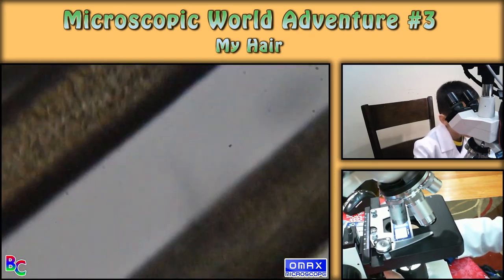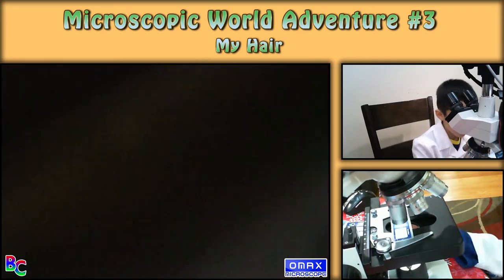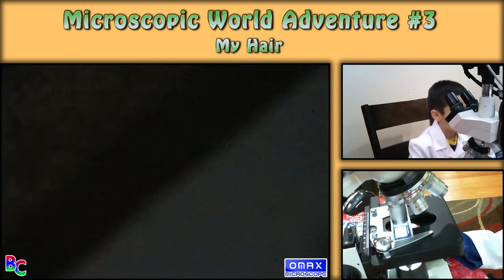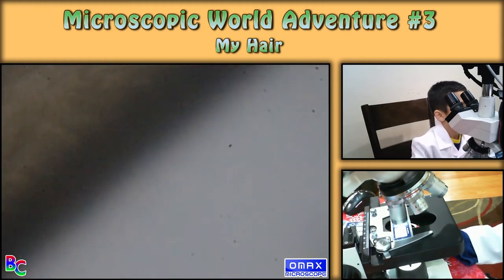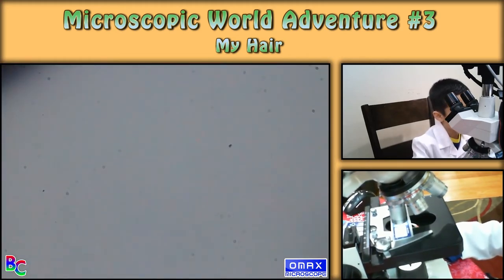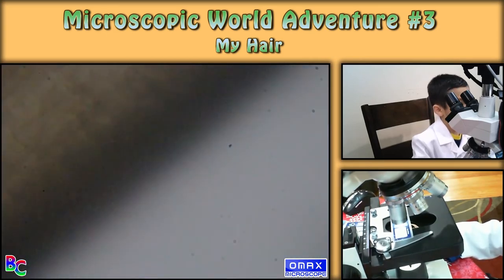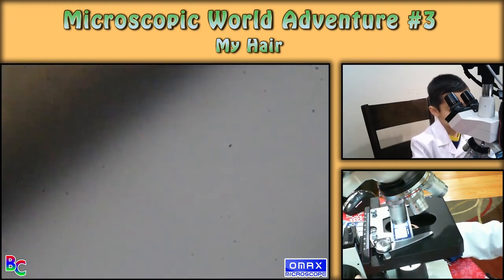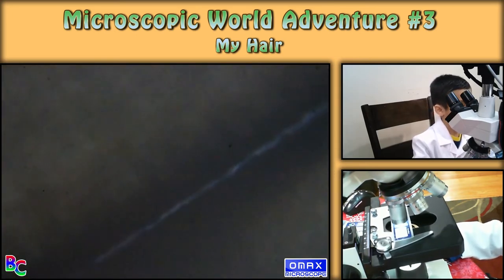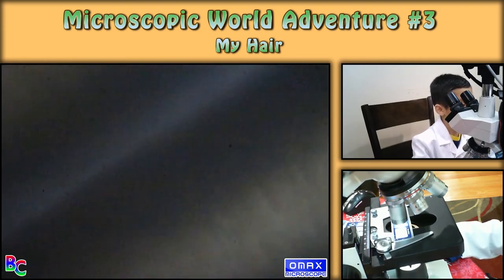This is the last one — the biggest one. This is so hard to focus. This is the best I could focus.